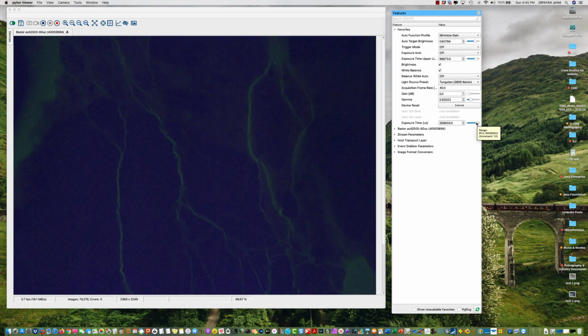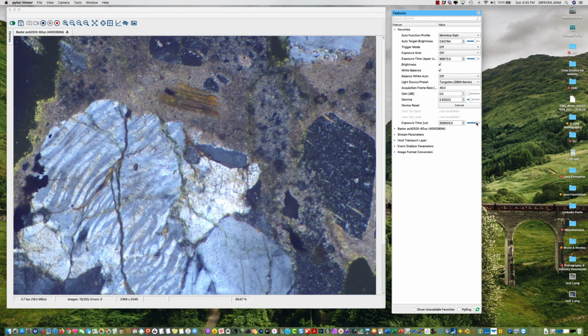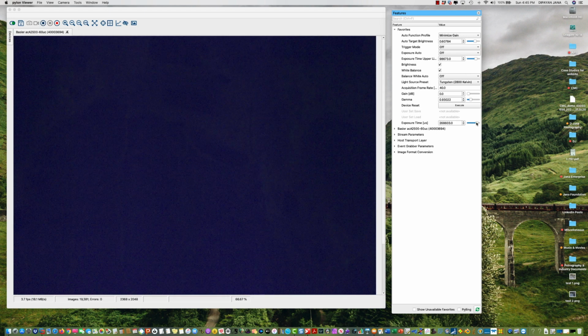And to go back to the plane and cross polarized, to the transmitted light mode from the reflected light, you close the shutter for the reflected light, you move your filter cube, and then you open the transmitted light. That's how you go back to your transmitted light view. Again, to go back to the reflected fluorescent light, you close the light source at the bottom, you open the light source at the epifluorescent attachment, and you bring the filter.